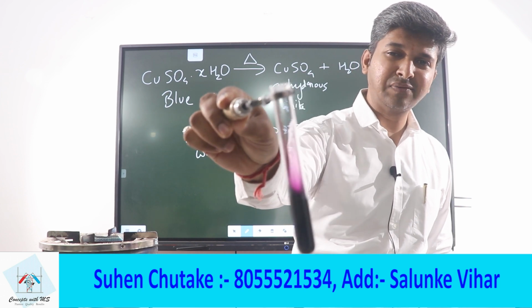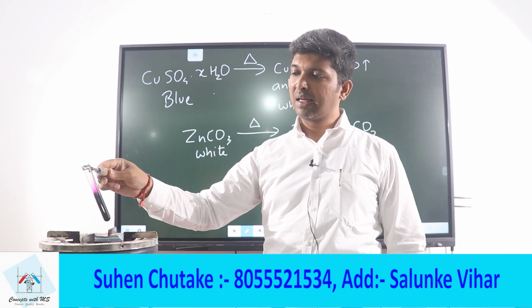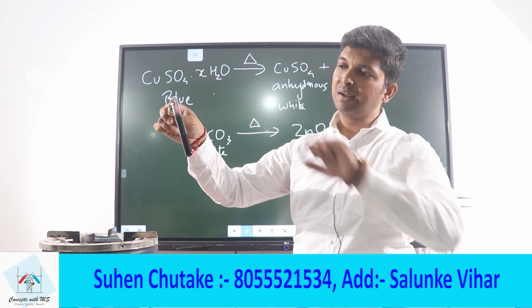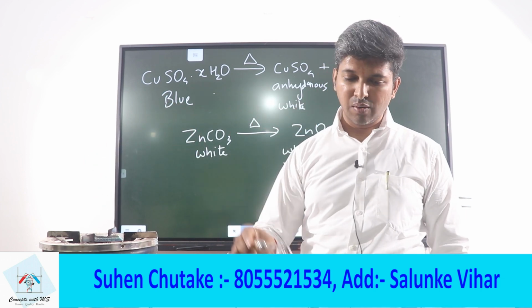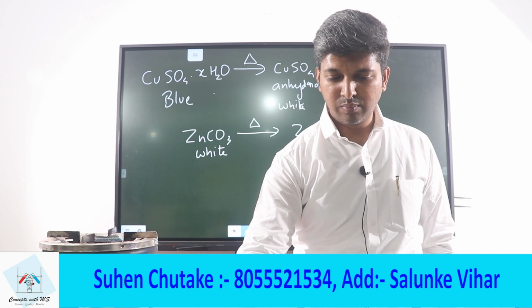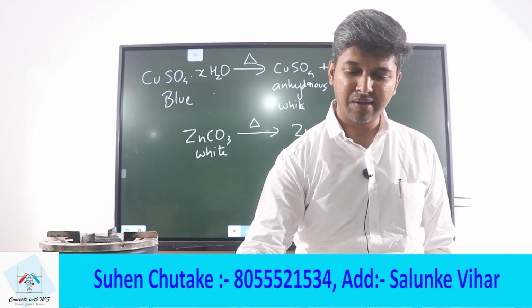These are violetish fumes, because of iodine crystals. And you can see that on top of the test tube, because it is colder, iodine crystals are depositing over there. So iodine on heating sublimes, it is converted into vapors. Violet colored vapors or fumes of iodine are seen when it is heated.